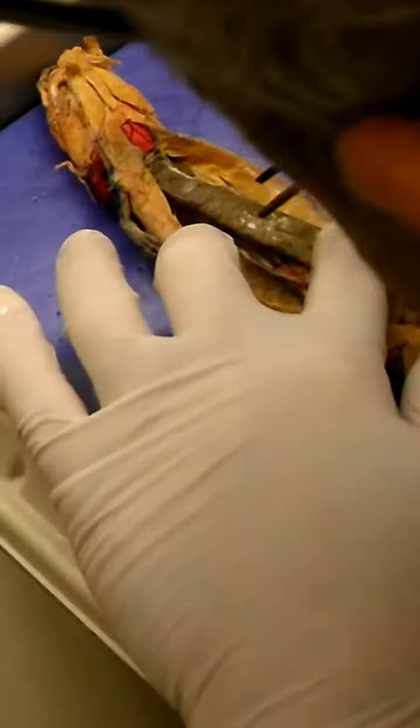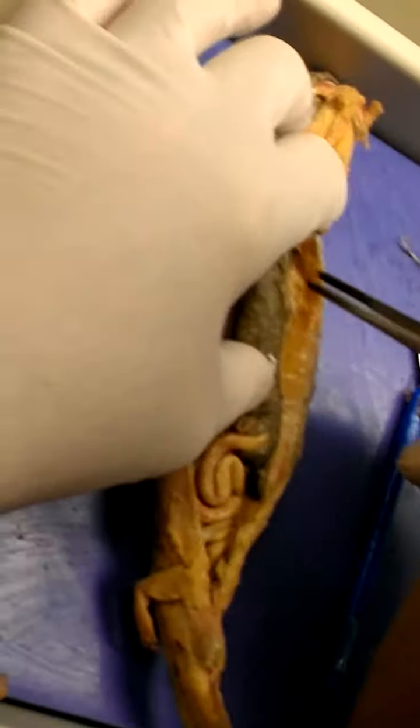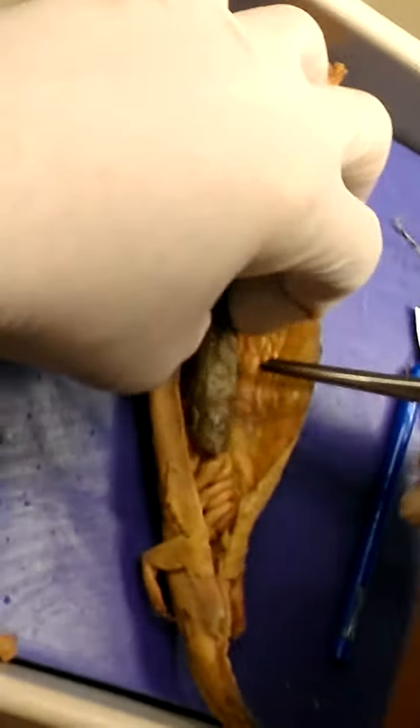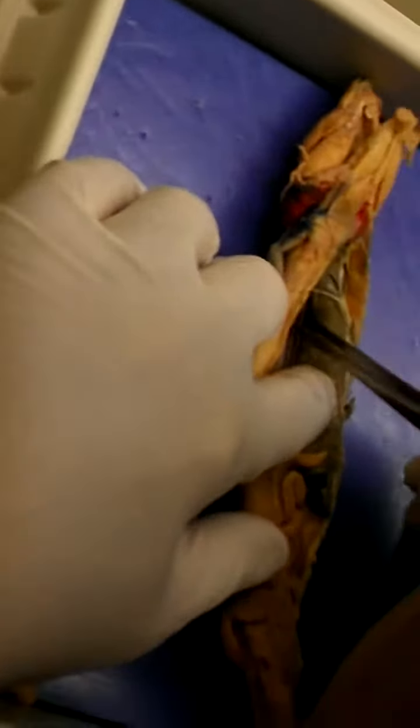This liver, which is this long structure right here. This tissue structure that seems to be forming a sac on the liver should be the gallbladder. Let me make sure. Okay. All right. Hang on.